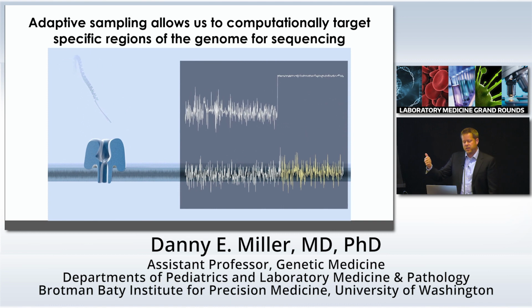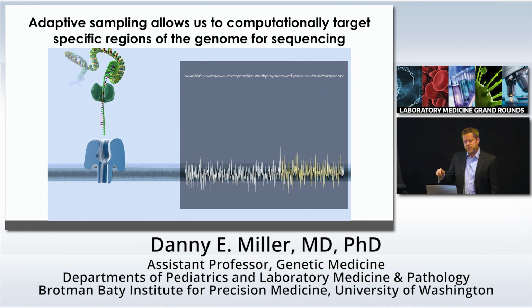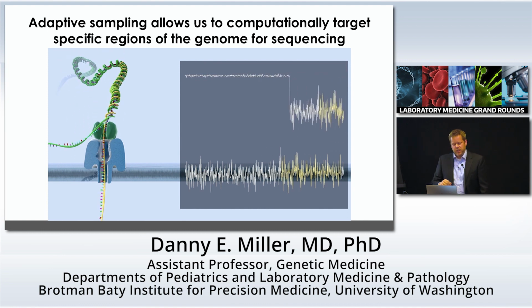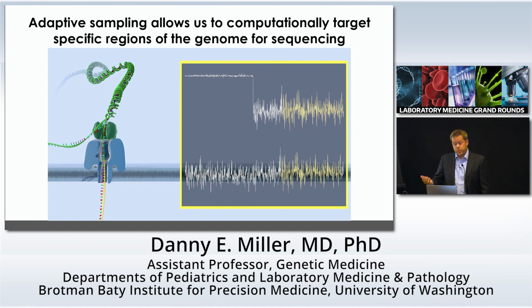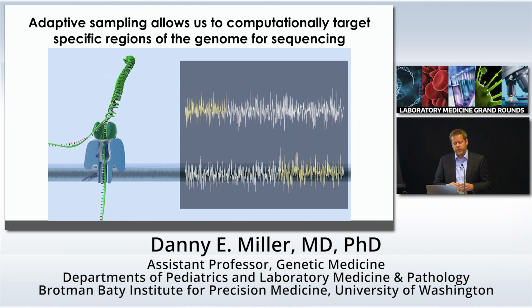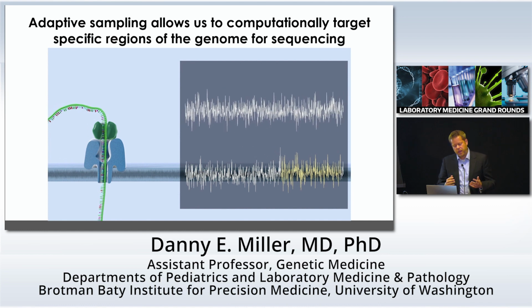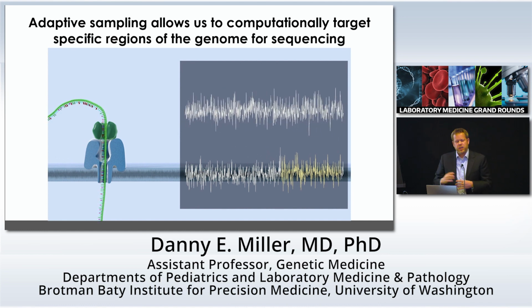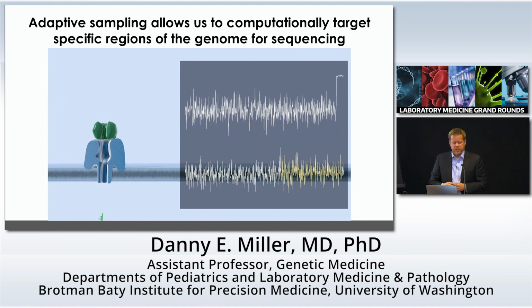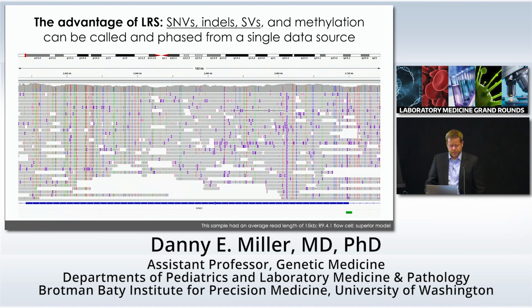It reverses the current, you eliminate the molecule, and then you grab a new molecule for sequencing. This lets you enrich for specific regions of the genome during sequencing. This is targeted long-read sequencing. You can do this to enrich. You can use this to deplete. This has been highly useful for a lot of microbial studies, for example. We did this during residency, trying to sequence just specific regions of the genome in individuals with missing variants, for example. So kind of cool things that you can do with this technology with the control that you have over the individual pores.